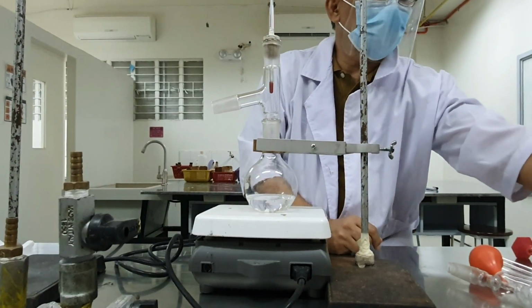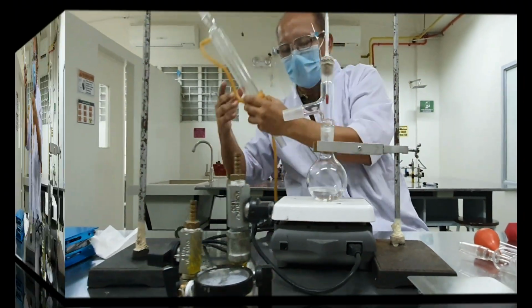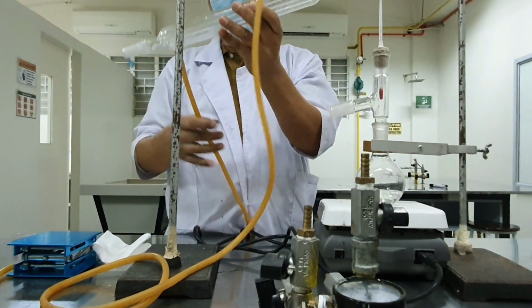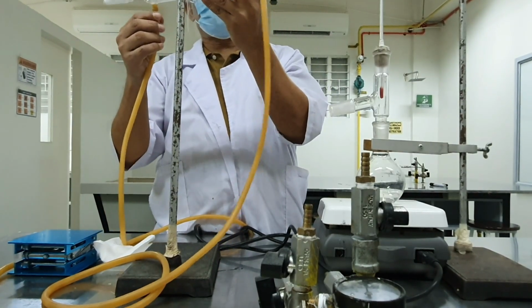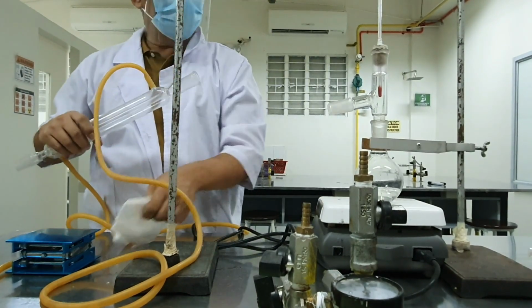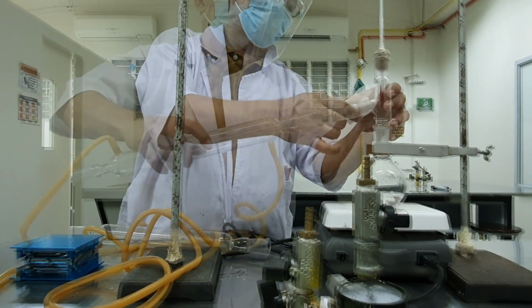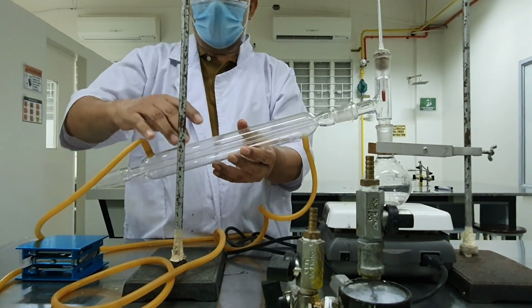Now we're going to attach our condenser. So this is our condenser. The water outlet should be up. The water inlet should be down. So the condenser should be positioned like this one. Okay. So we are going to lubricate again the connection.